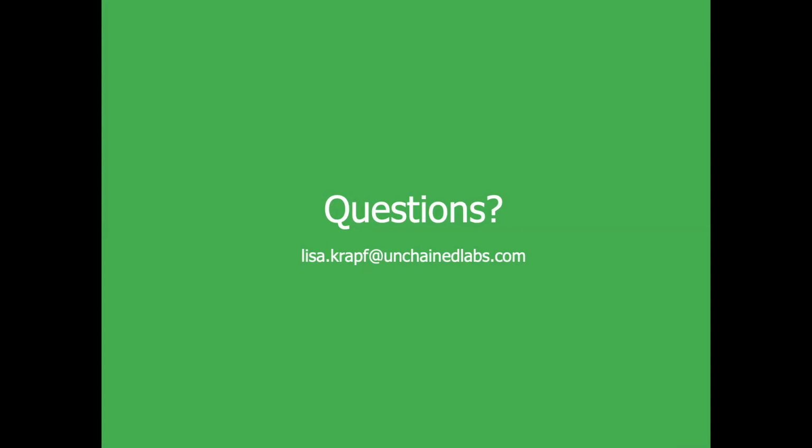Okay, great. Lisa, I think this will be the last question for you for the day. The question is, we're working on building an image library of particles as well as spectroscopic characterization. Does Hound do anything to help us build that library too?